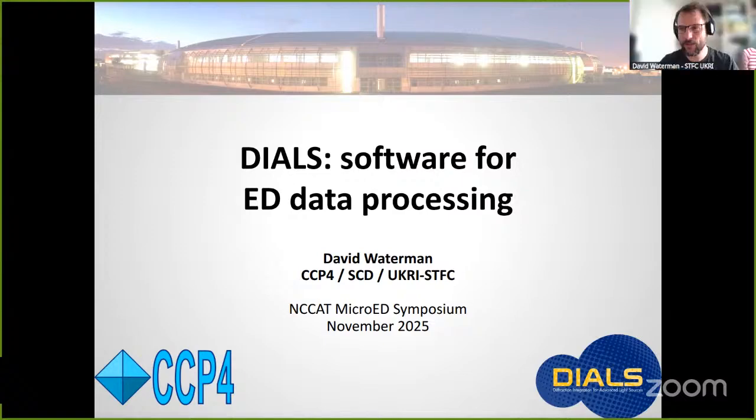Okay, so yeah, thanks to all the organizers for inviting me again to this really excellent symposium and workshop. I've got this first session, first hour and a half, I'll split between some slides I've got about DIALS and its adaptation to ED methods, and then, as Dan said, a walkthrough with one of the tutorial data sets. So yeah, my slides. My name's David. I'm part of the CCP4 core team based at Harwell in the UK, and we're right next to the Diamond Light Source synchrotron, which you can see on the header of all my slides.